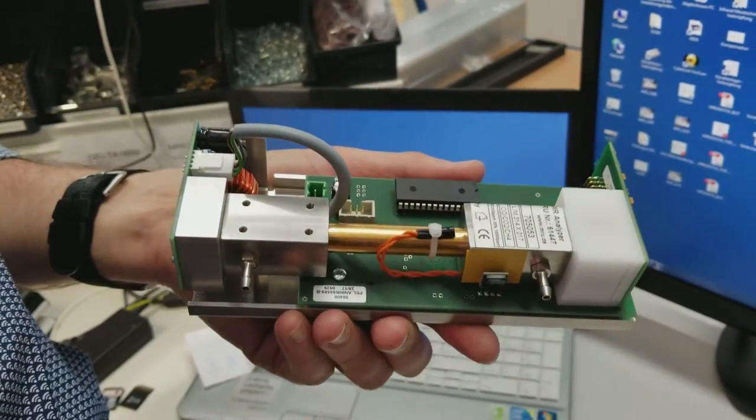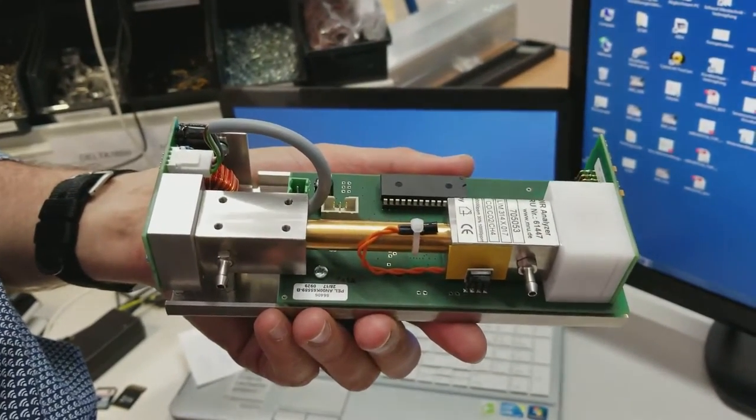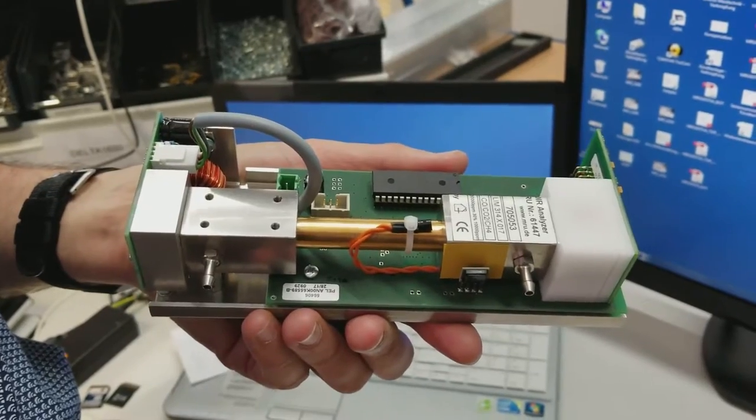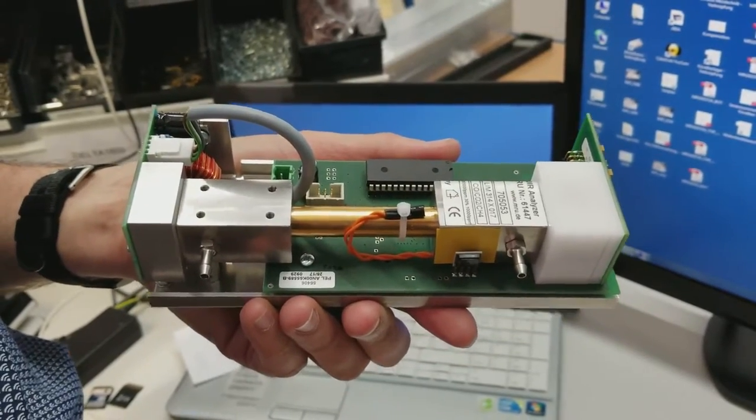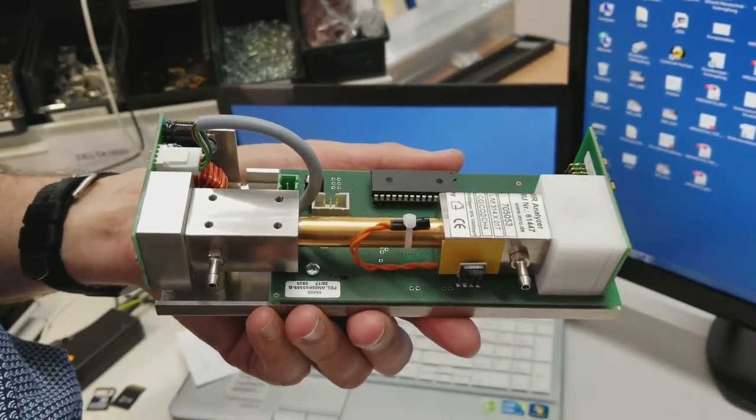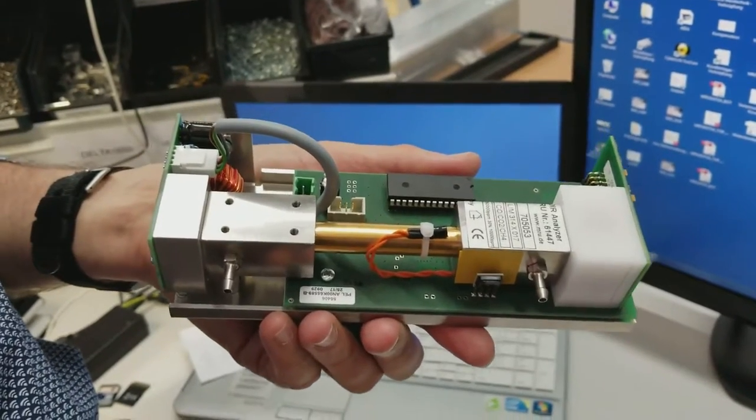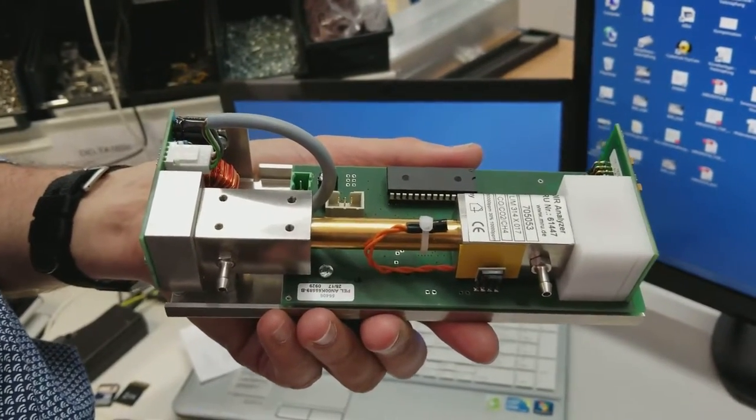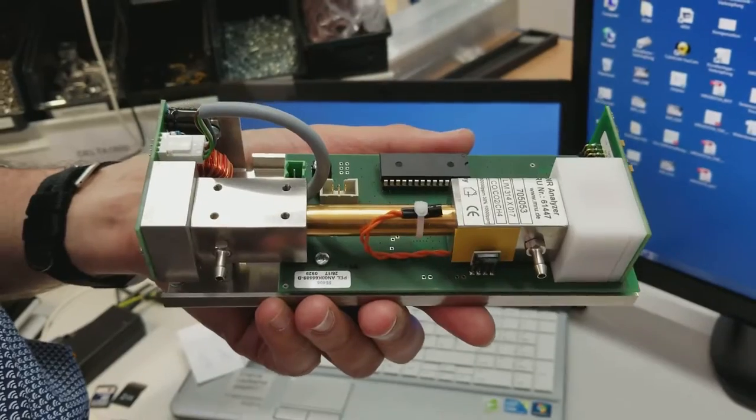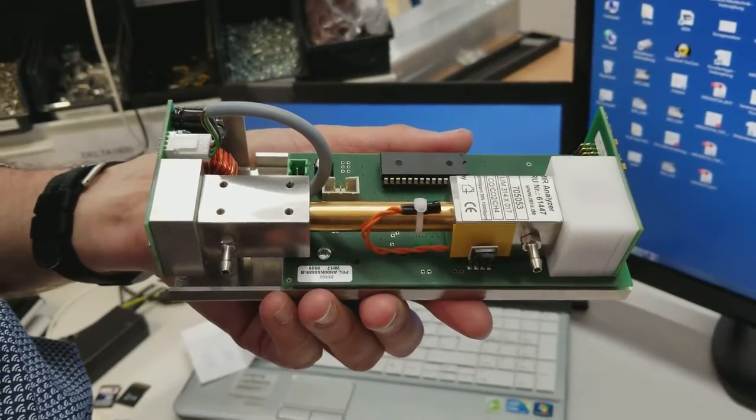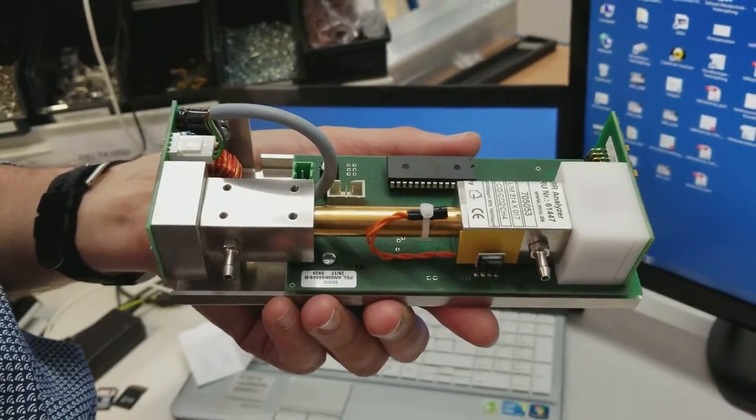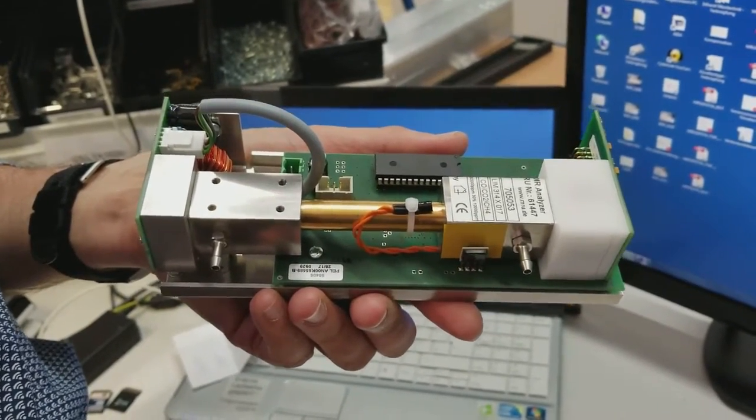And on the other hand, we have an infrared detector, which is in fact here a quad detector, that means four gases at the same time. And it is made gas-specific by means of the optical filter, which is put in front of each of those optical sensitive elements.